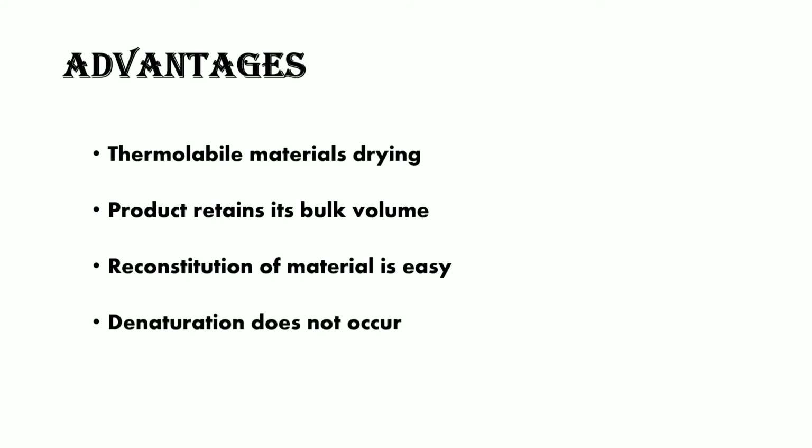Now let's see the advantages of the freeze dryer. So the advantages include that it is helpful to dry thermolabile material. Products with a bulk volume can be dried with this freeze dryer. Reconstitution of material is very easy with the freeze dryer. Denaturation does not occur in this, as well as the loss of volatile material is very less in this particular freeze dryer.